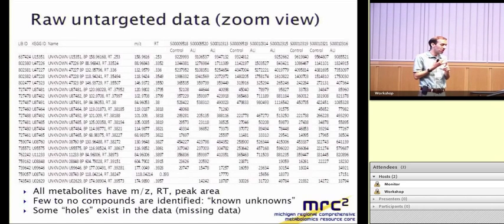You can impute a value. You can impute a small value. Not a bad idea would be to use something approximately the lower limit of detection, or maybe half of the lower limit of detection for that metabolite. And that can be construed based on the other metabolites that are present in the data set. There's various means of imputation. K nearest neighbor is one that I'm familiar with that the various programs will use. I'm not an expert in those imputation methods.